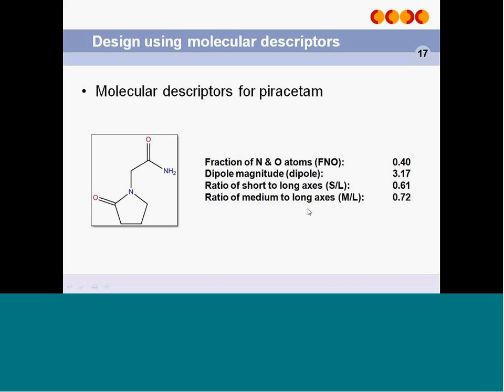And then the principle is we calculate the molecular descriptors for each of the coformer molecules and match using some of Laszlo's rules of thumb for molecular complementarity to identify which of the coformers are the most likely to form a co-crystal. And again, we're using predictive analytics here to narrow down the options to try and reduce the amount of time and resource we spend on co-crystal screening.